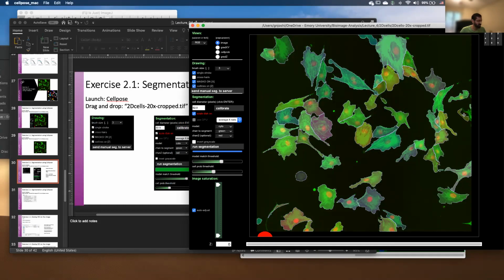So I'm using Mac, it's command and left click on my Mac. I think on PC, it's control and left click. So if you are using Mac, it's command and left click. But if you're using a PC, it's control and left click, okay?